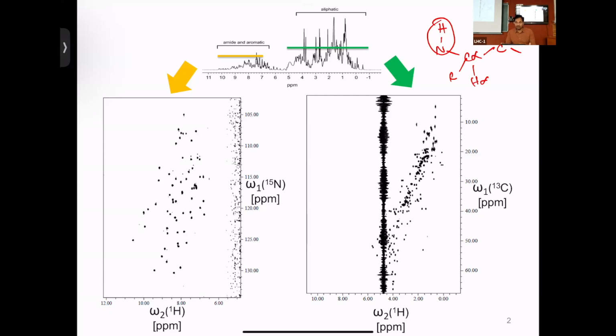My request is, go back and take a look at the chemical structures of amino acids. It'll help. Do that before coming tomorrow so that you convince yourself on that aspect. But take it from me right now, every amino acid has an NH. So if you take a polypeptide which has 55 amino acids, you expect 55 peaks to exist here, because each NH should give you a signal, making it a molecular fingerprint, except for prolines.